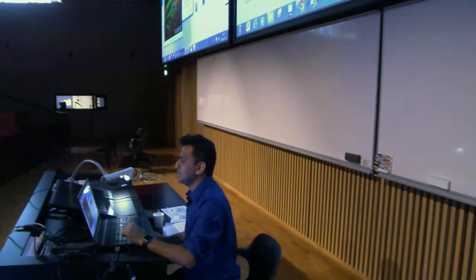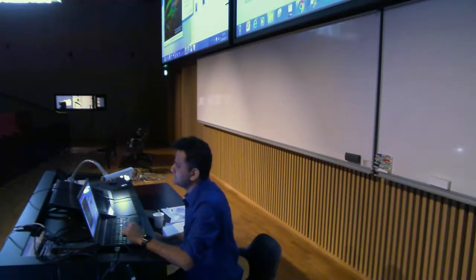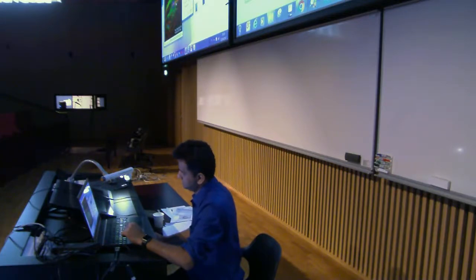So the difference between the overlay switching on and off is that if you do not say overlay, the scale bar will be a part of your image. Like for example, we are at the first channel, which is a red channel. That's why the scale bar is red. If you hit OK, and then say Analyze, Tools, Scale Bar, and now it will be at Selection, Overlay. That's strange.